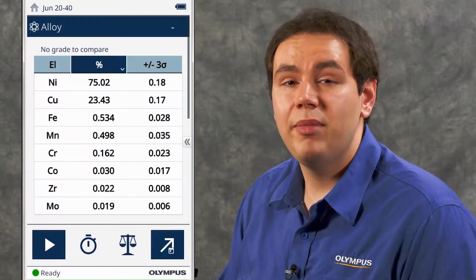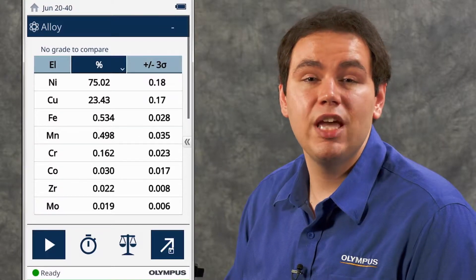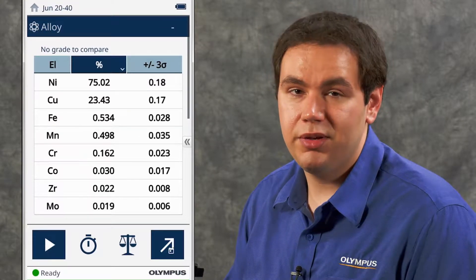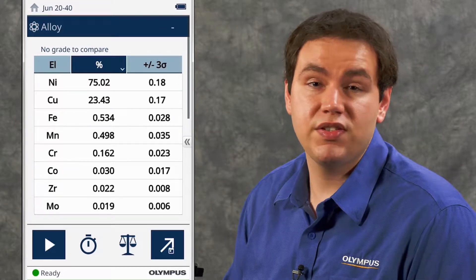The most common reason for no match to occur is sample contamination. This can happen when a sample is painted, plated, or coated. Since we're working with a known alloy standard, however, contamination doesn't seem to be our issue.